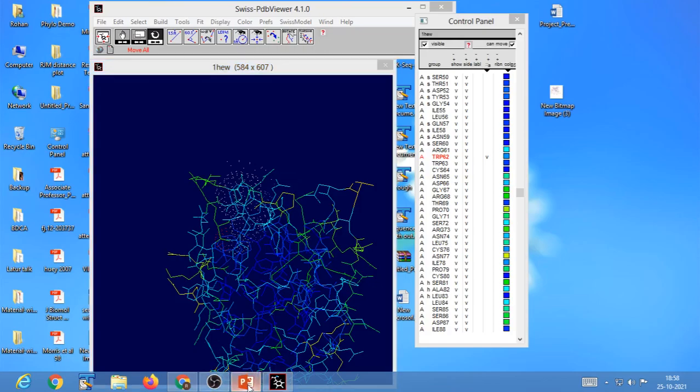In short, what I want to express is that if this is your protein molecule, say some side chain of your protein molecule, it will have some van der Waals surface. It is not necessary that all of the van der Waals surface would be accessible to solvent.